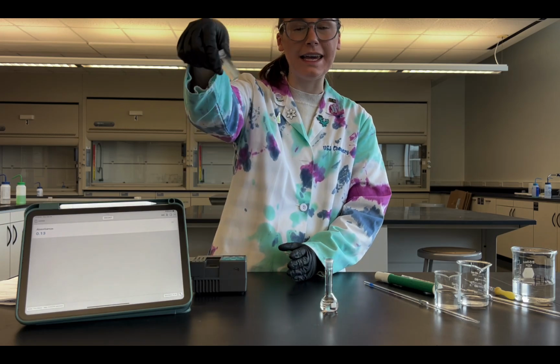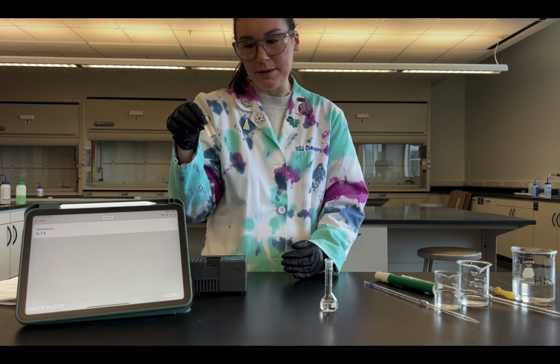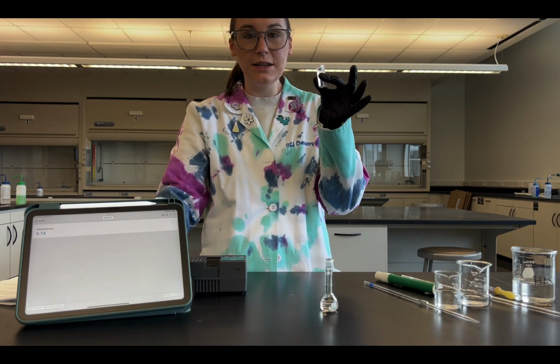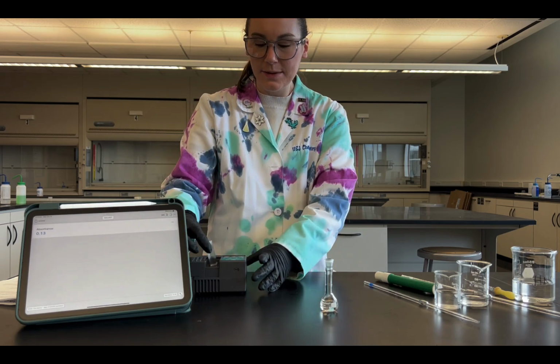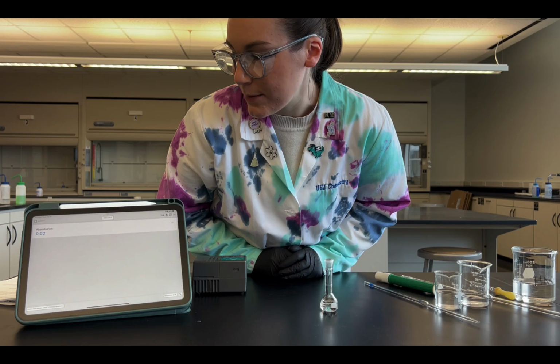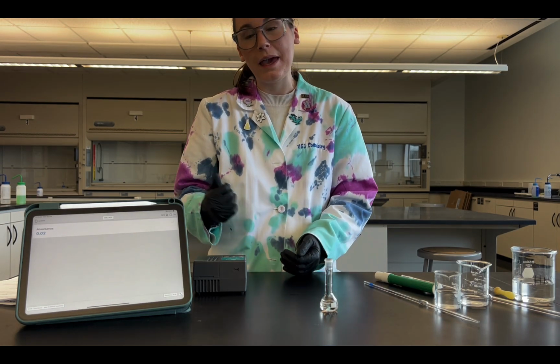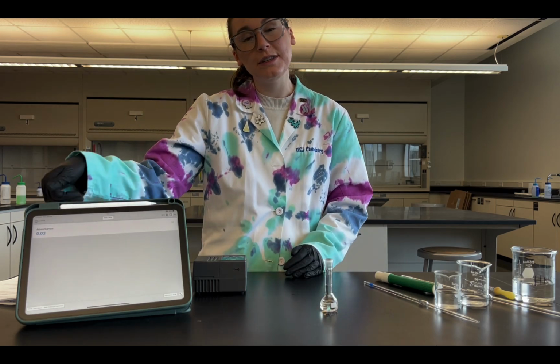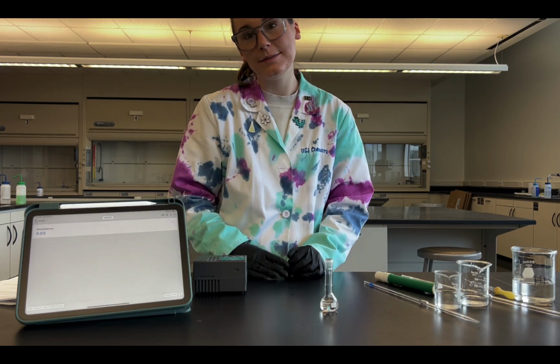Because this is so light in color, the absorbance is going to be really small. And obviously it doesn't have any of that yellow color in it. So if I tried to put this in with my other blank, it wouldn't read any absorbance. So I could put this in here and read the absorbance. Again, it's going to be really small, so 0.03. Now, if we were to make the other test tubes, like let's say test tube number 10, this would be significantly darker and have a significantly higher absorbance.